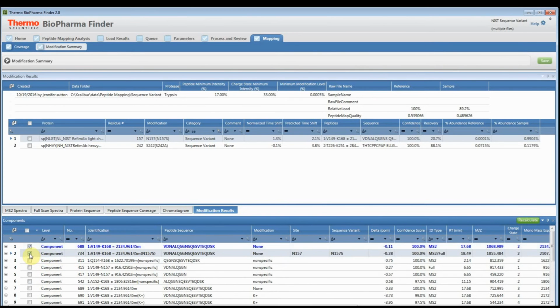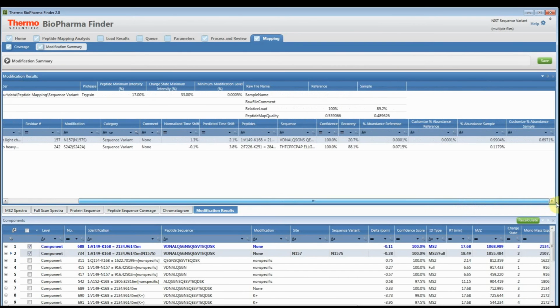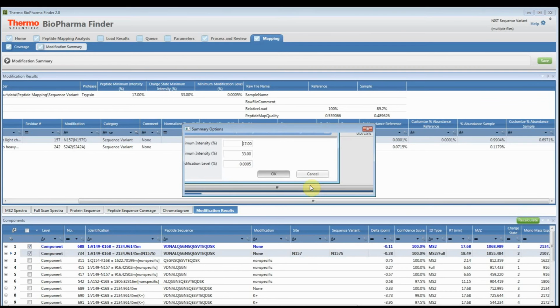So those are the ones that you're going to use, and you hit recalculate. And so now what the software has done is it's using whatever value you tell it to use. Okay, so it's changed, and it'll say whatever you like. If you click on here, you'll notice that it's, actually, let's save it. So we need to save it.